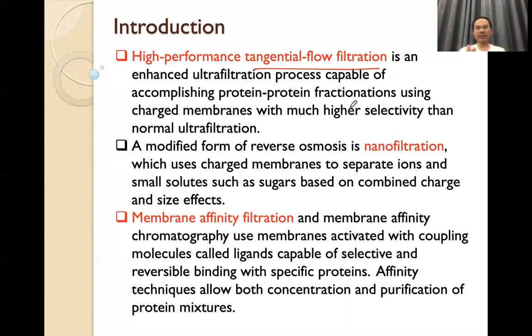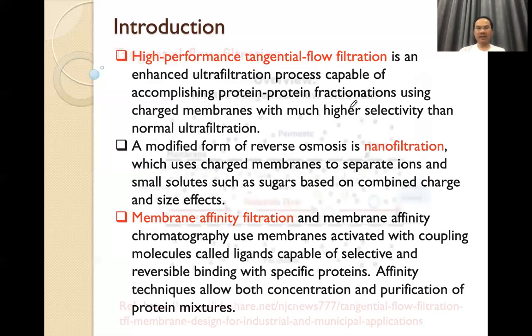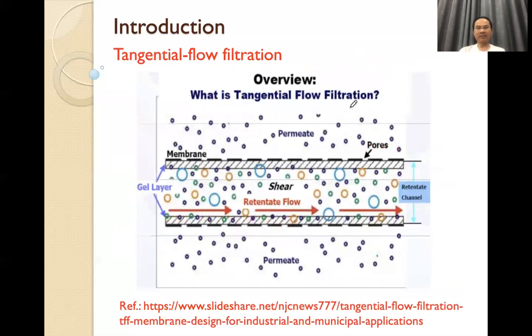And also membrane affinity filtration. Membrane affinity filtration looks like the charged membrane, but the membrane is modified with activated carbon or a ligand. The solute we would like to separate interacts with the ligand, or can be adsorbed by the activated carbon. That is the membrane affinity filtration.